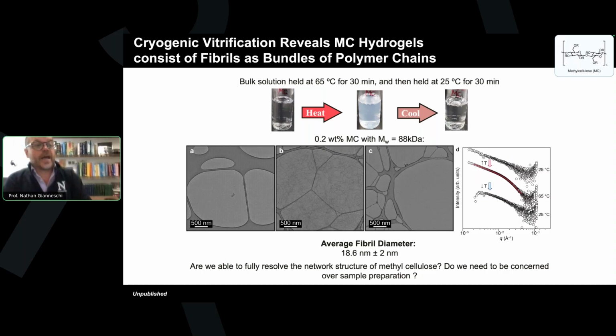Okay, let's go back to the slide I showed you earlier. This was a bulk solution experiment, heating up to make a gel, cooling down to disperse the polymer, and then capturing and shearing this gel at that heated point and getting a cryo-TEM image. This is exactly replicating what had been shown in literature. And if you look at the top right, that's to remind you of the structure of the methyl-modified cellulosic type material that we're looking at.